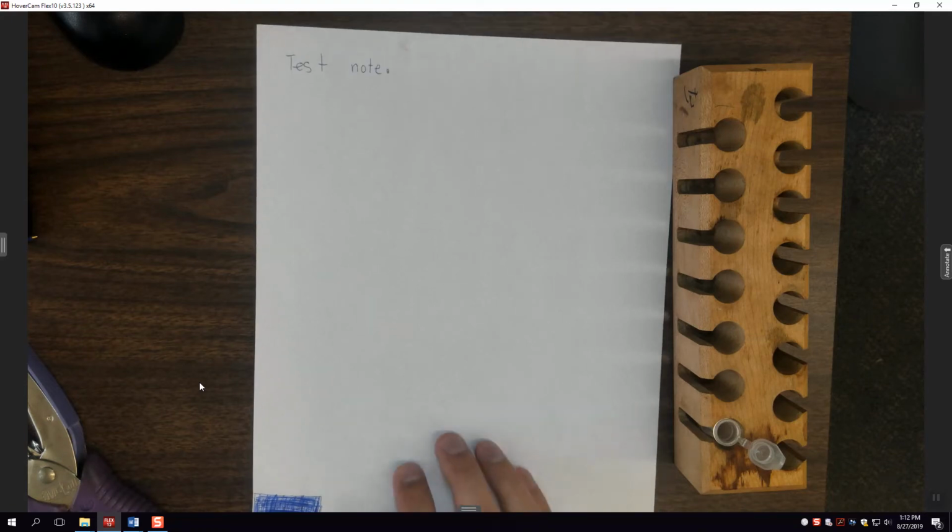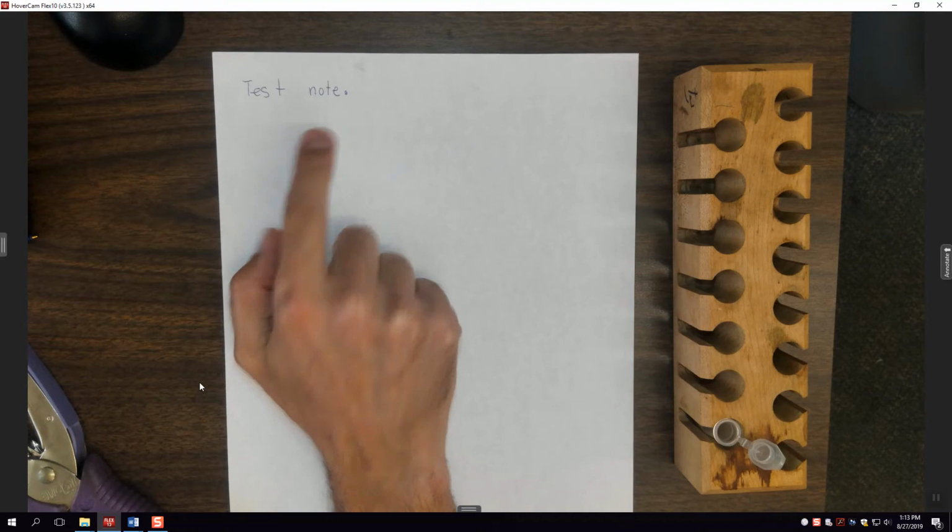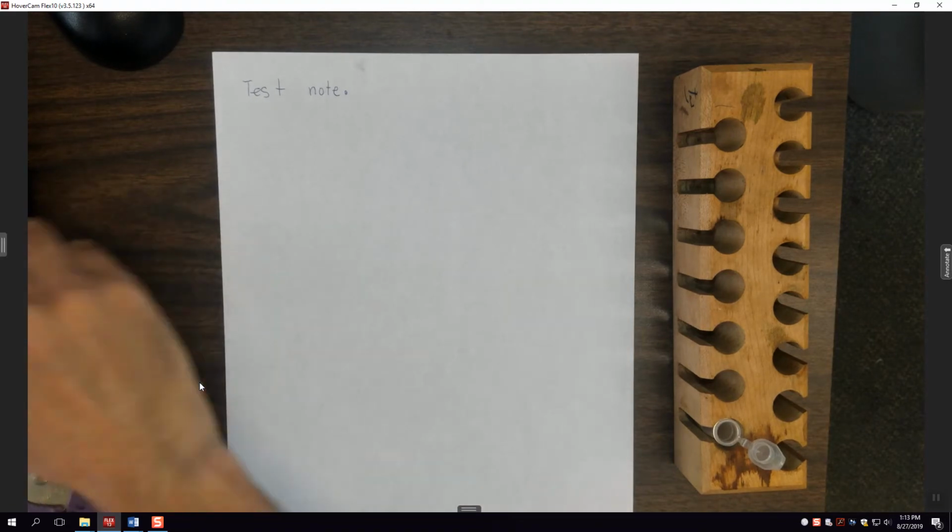Hi everyone. In this video I wanted to talk about the TLC of dyes experiment. So what you're going to end up with is some example ransom notes, and they're not going to look exactly like this, but mine is just a test note that I made with my blue pen.